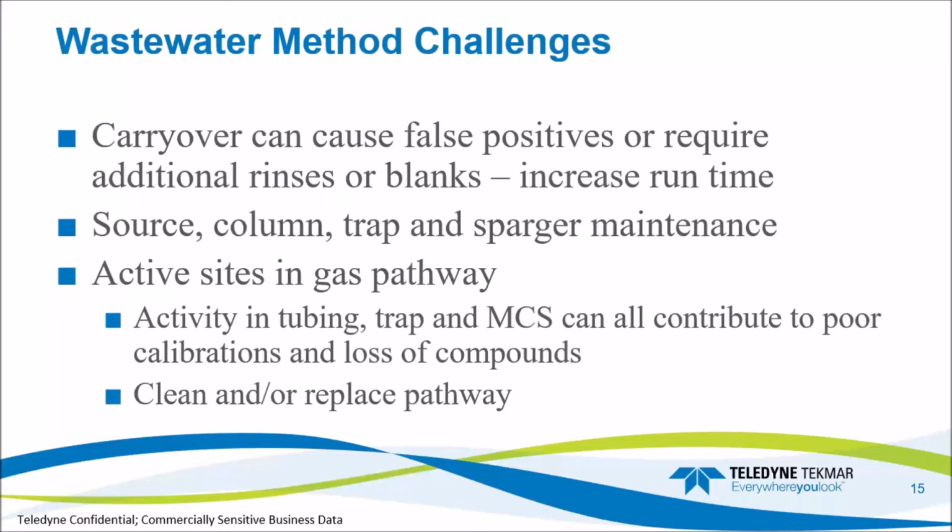So the only real option here is to pre-screen our samples to figure out what we're getting ourselves into as far as concentration and dilute the sample if needed. But also, just so we know, how often we need to clean and maintain our system. If those samples are really dirty, obviously we need to clean and maintain our system more often and replace our consumables as necessary.